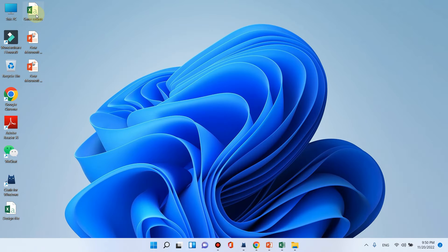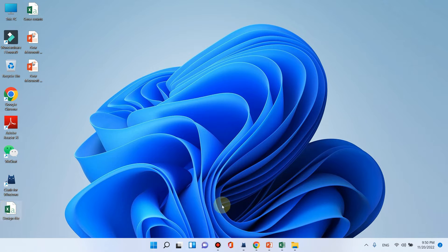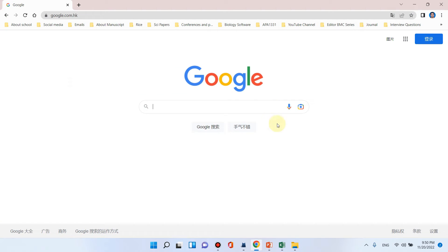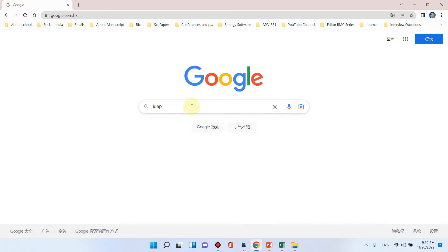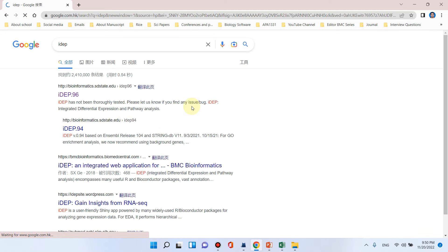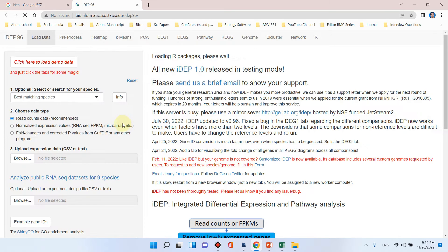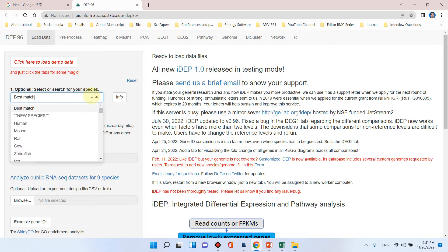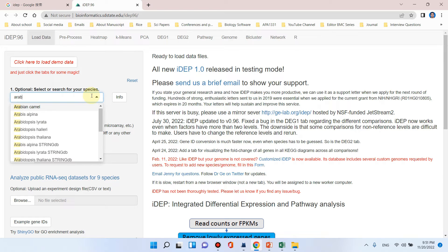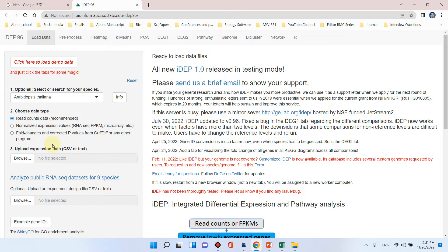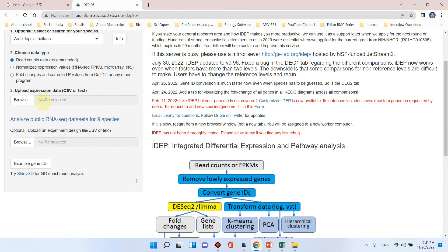Now our gene counts and design file is ready. We need to simply go to Google and write iDEP. Click on the first link. First of all, here you need to select your best matching species. Because our experiment was related to Arabidopsis, we need to select Arabidopsis thaliana as best matching species. Here we need to upload expression data in the form of CSV or text file.